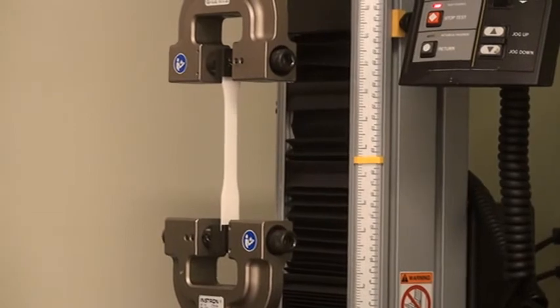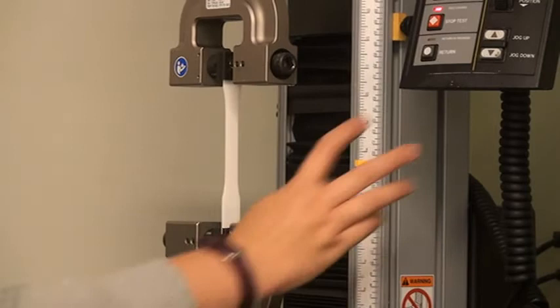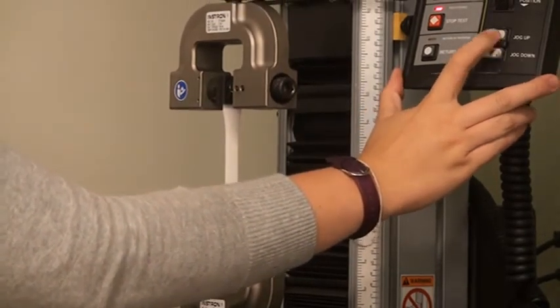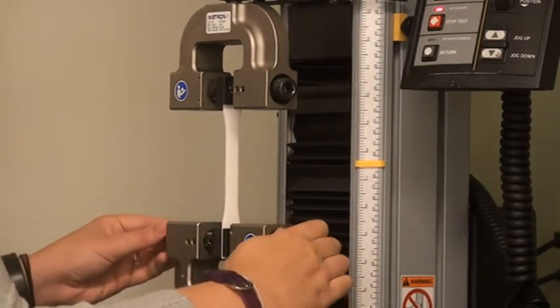Use the keypad to jog the actuator down until your sample is in the desired position in the lower grip. Tighten the screw knobs to grip your sample.